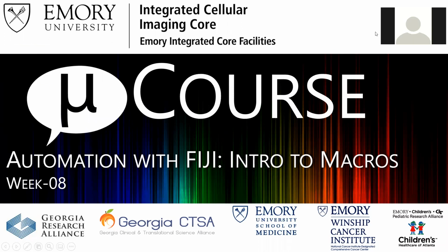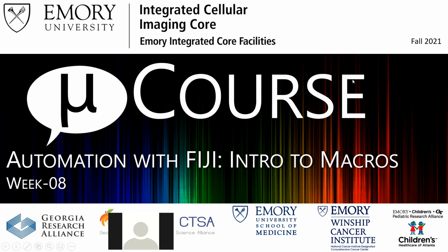So I'm Stoyan Ivanov. Most of you have probably seen my face as Gaurav has been talking these last 7 helpful weeks. But today I will be leading this talk and intro into macros for use with Fiji.